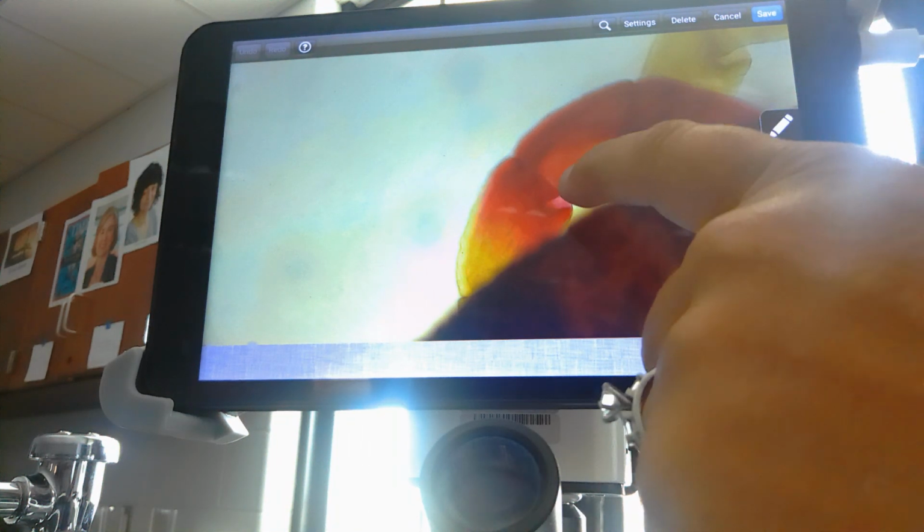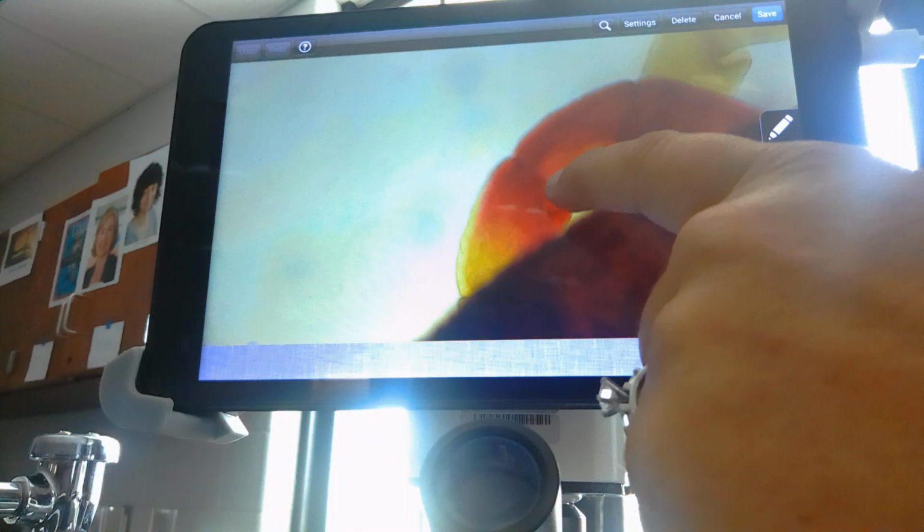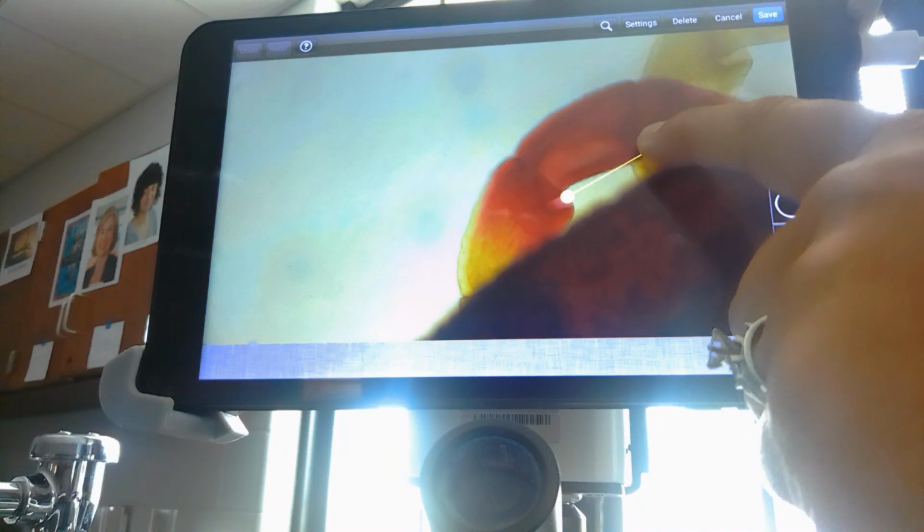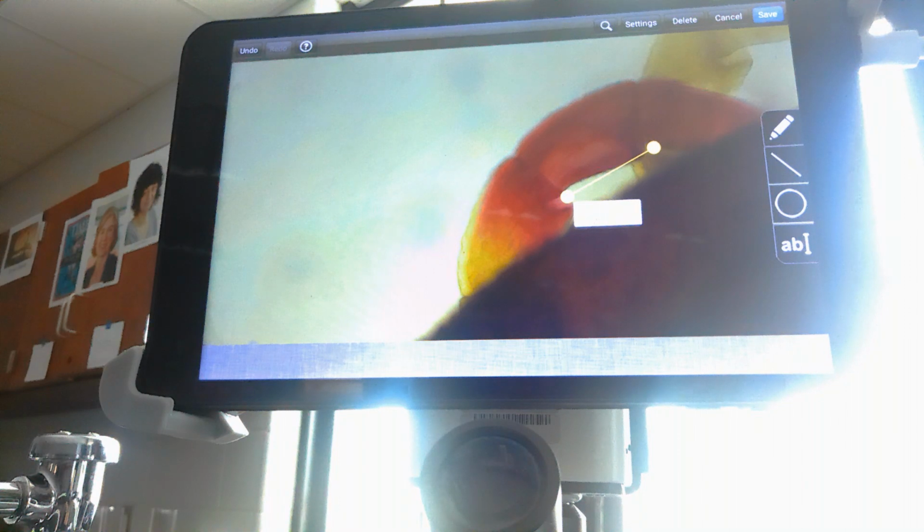function. And it is a touch screen, so as long as you touch the one part that you want and drag it to the other part, you'll see a line shows up, and then on that line there will be a measurement. Sorry, you can't see it. I'm guessing there's a glare, or it's probably from photo to photo, from camera to camera. But this will say, like this one right here says L1 length.